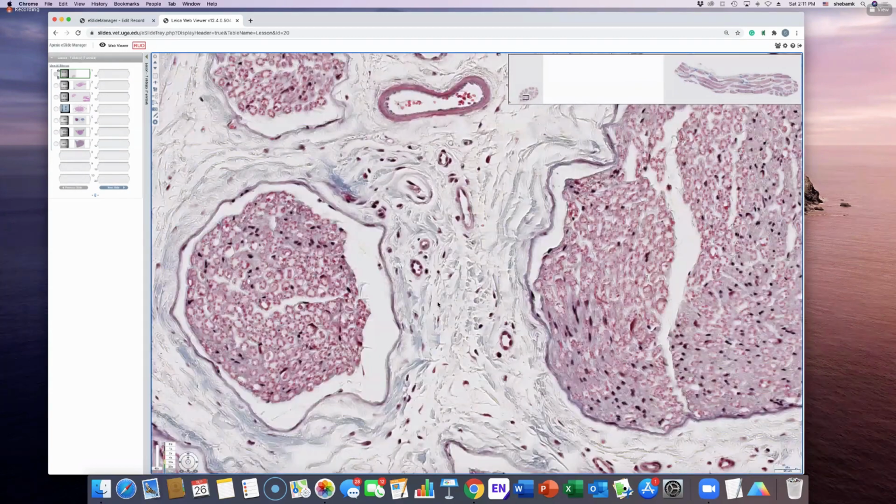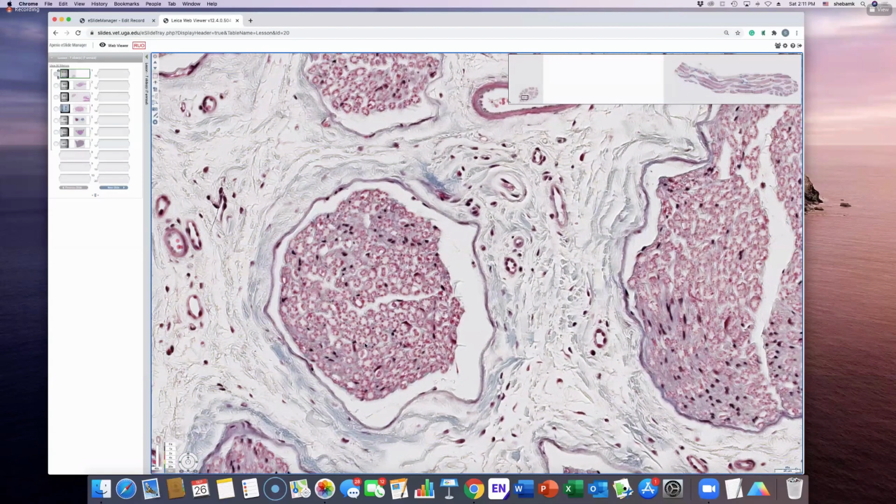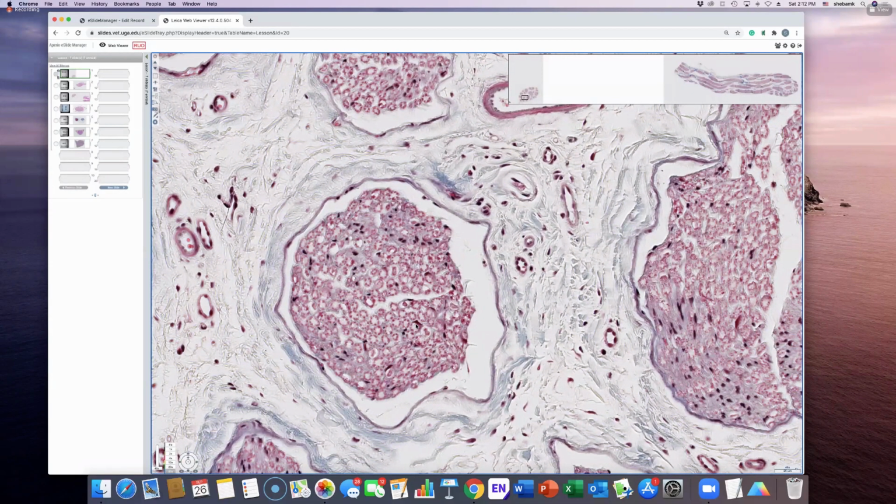Myelinated. Okay, and the nuclei that are associated with this are nuclei of, you said peripheral nervous system. Yeah, so peripheral nervous system. So these would be Schwann cells or neurolemmocytes. Okay, so this pink stuff is called neurokeratin. Yes, this is neurokeratin.